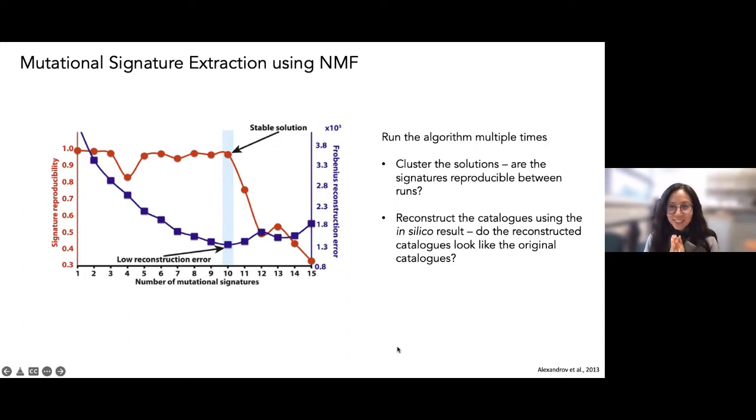In general, the total number of signatures that are found, let's say the answer should be 10, but you've chosen 11 or you've chosen 9. In general, the big important signatures that matter to the patient, you will find, because they tend to be quite clear. If something is a little bit weak, then you probably haven't got that signature in the sample, okay? So in general, even if you are one off, it's probably fine. Okay, so that is the extraction process.